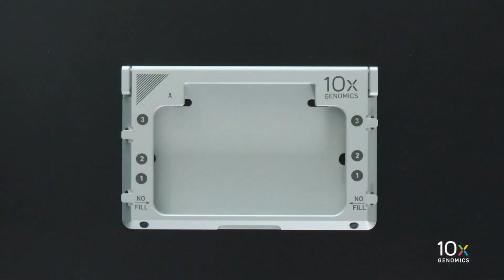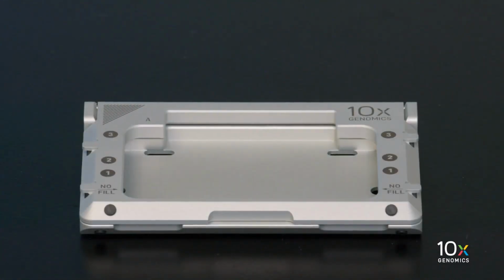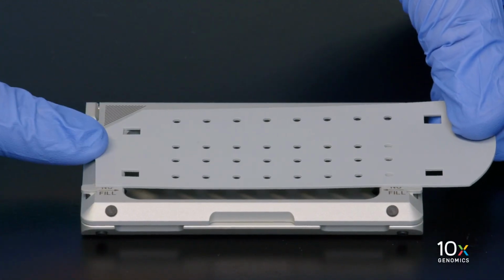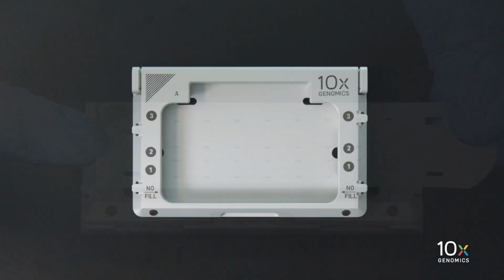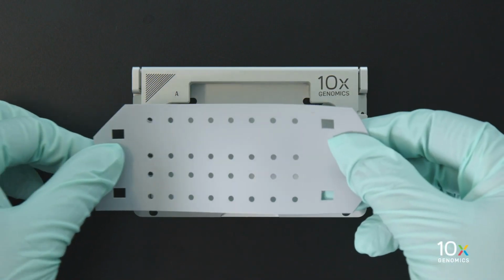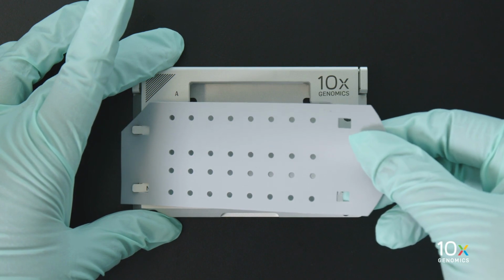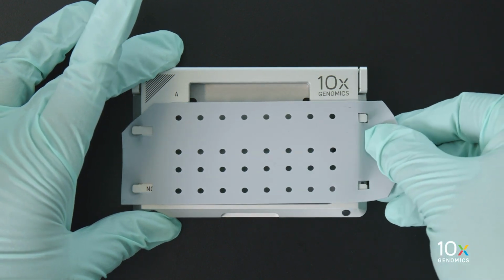Ensure the secondary holder is closed before attaching the gasket. The gasket attaches in only one orientation, with the notch on the upper left-hand corner. Attach the gasket by holding the tongue and hook the gasket on the left-hand tabs of the holder. Gently pull the gasket toward the right and hook it on the two right-hand tabs.